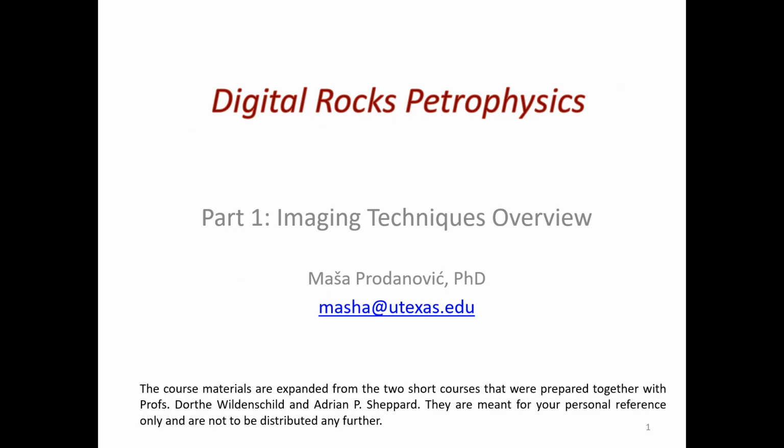We will focus in this review a lot on X-ray and some micromodels, because those are the techniques mostly used around this department. And as part of that, today we are going to go at 1:15 and visit Dr. DiCarlo's scanner downstairs. So we will overview how it works.